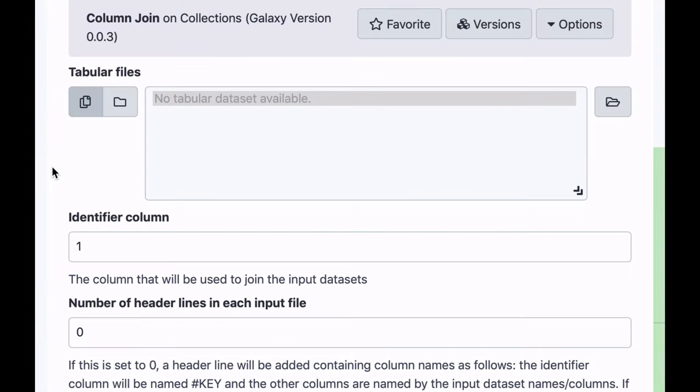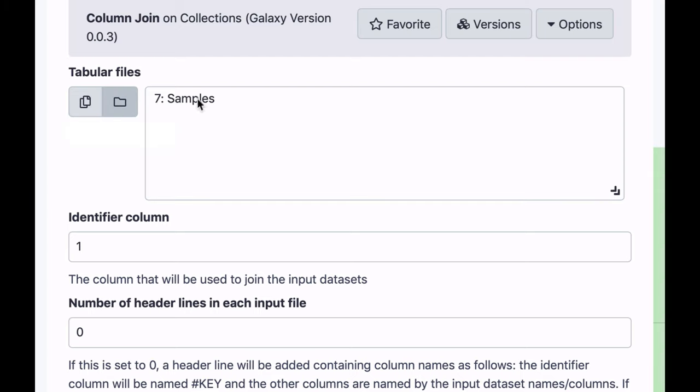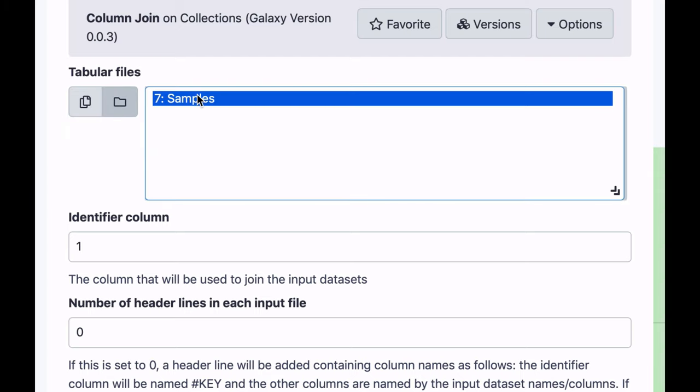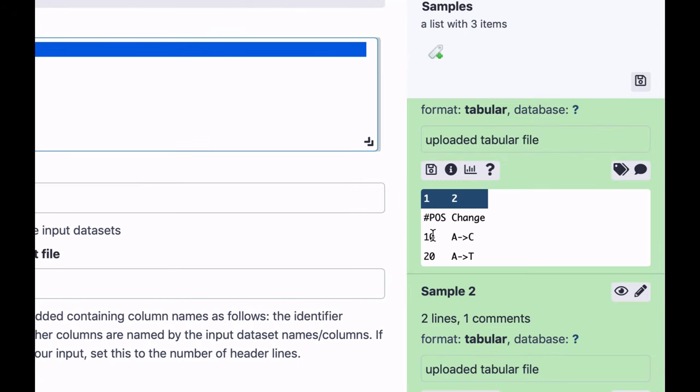This is a very powerful tool, and in this case we have a collection with just three datasets, but it will as easily work on a collection with 10,000 datasets. So let's select the collection in question, and the identifier column - in other words, the column on which to join things. In our case, that's the first column.